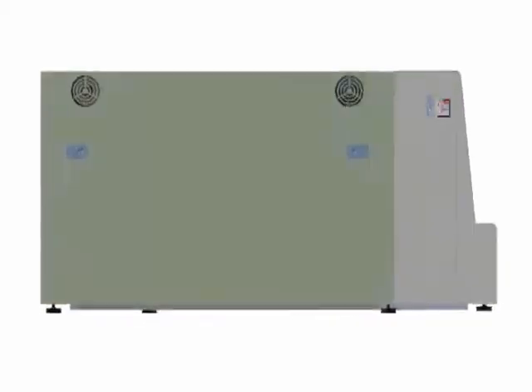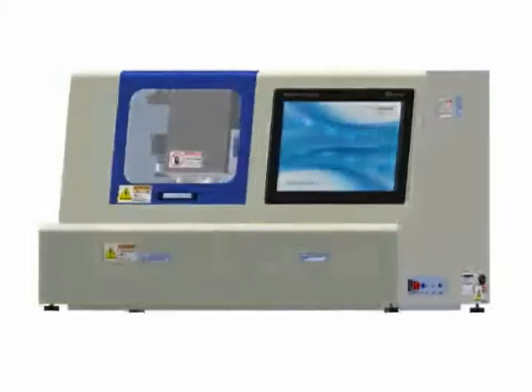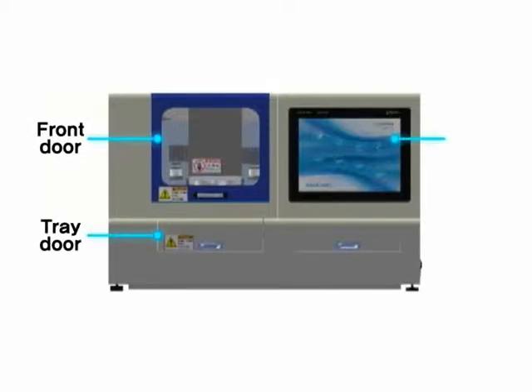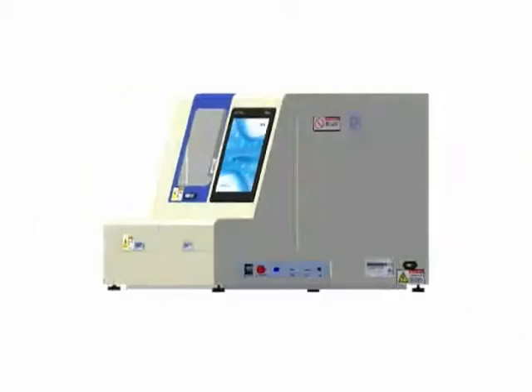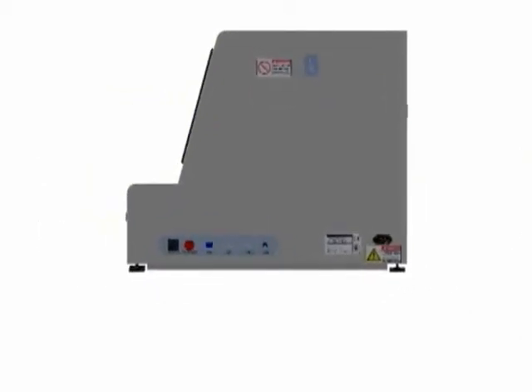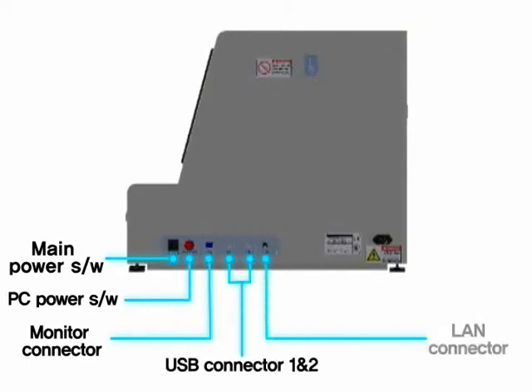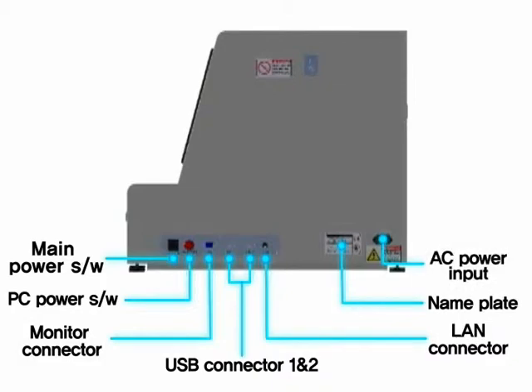Let me introduce the names and images of this instrument. On the front side are the front door, tray door, touchscreen, and drawer for the keyboard. On the right side are the main power switch, PC power switch, monitor connector, USB connector, LAN connector, nameplate, and AC power input part.